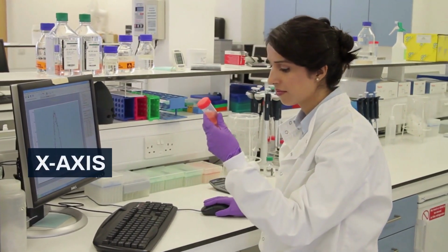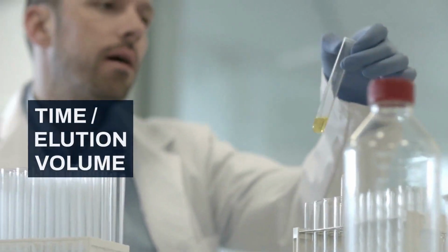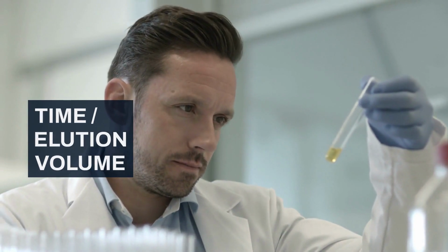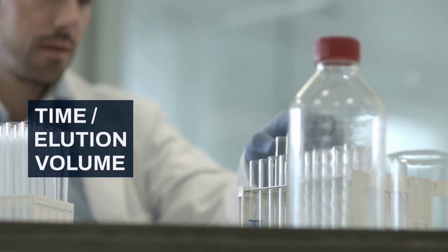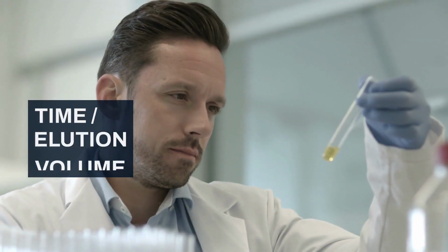First, look at the x-axis. This axis usually represents time, showing how long the experiment has run. Sometimes, it shows elution volume, which is the total amount of liquid that has passed through the column. This tells you when different components are coming out.